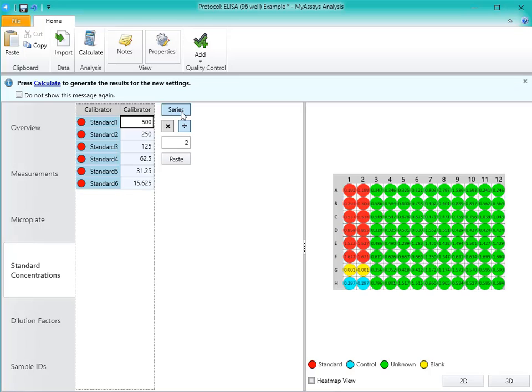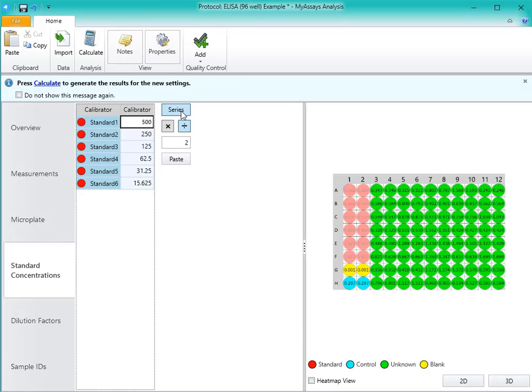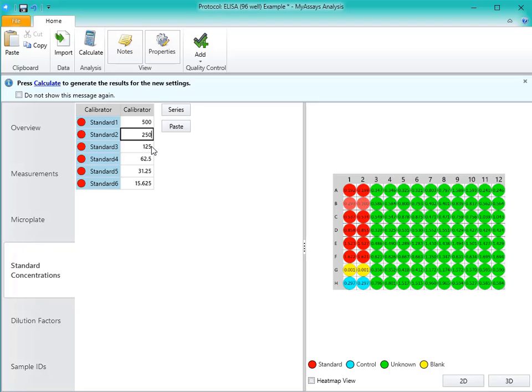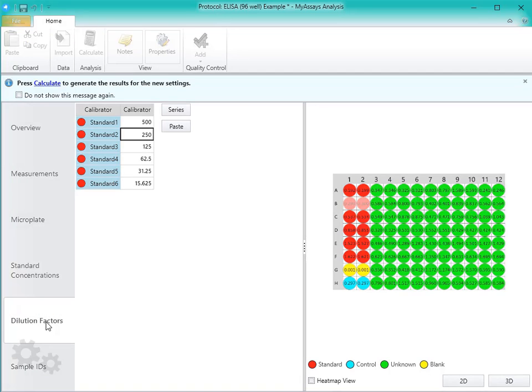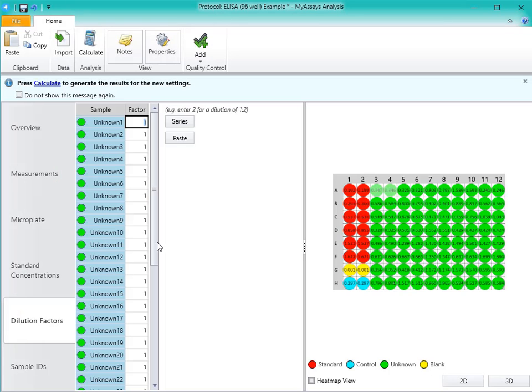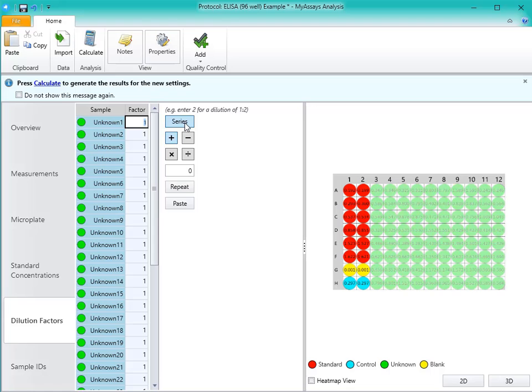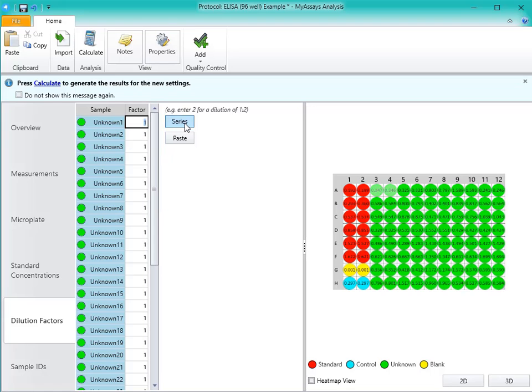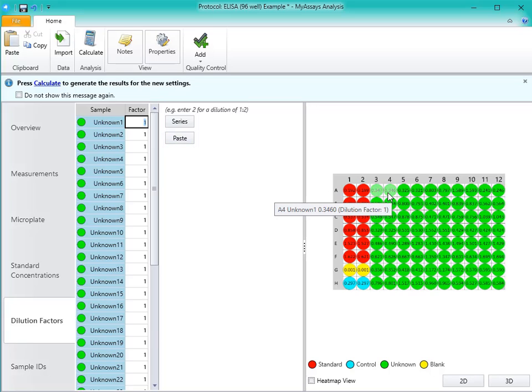By clicking the Series button to turn the Series mode off, I can individually define my standards if they don't follow a set series, or I can choose to copy and paste in the values from another application such as Excel. On the Dilution Factors tab, we can define the dilution factor for each unknown. You can again use the Series function, or copy and paste in the dilution factors from another application. You'll also notice the visual feedback is again provided in the right-hand side of the screen.